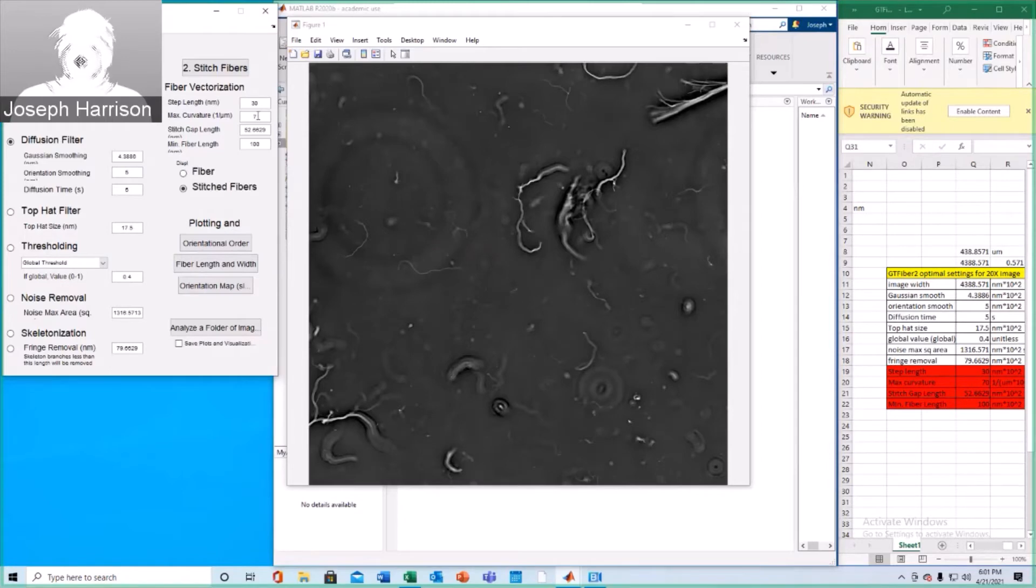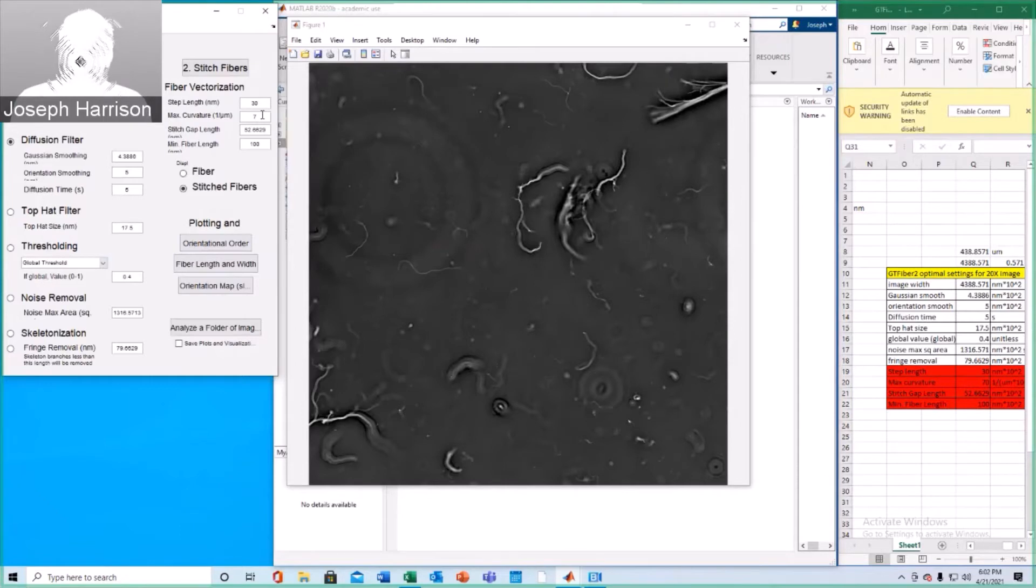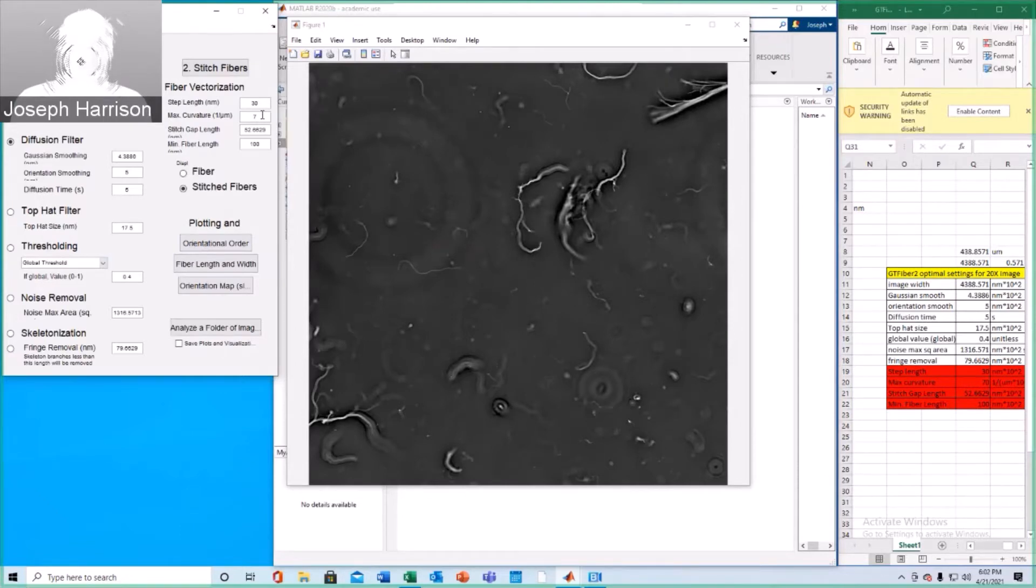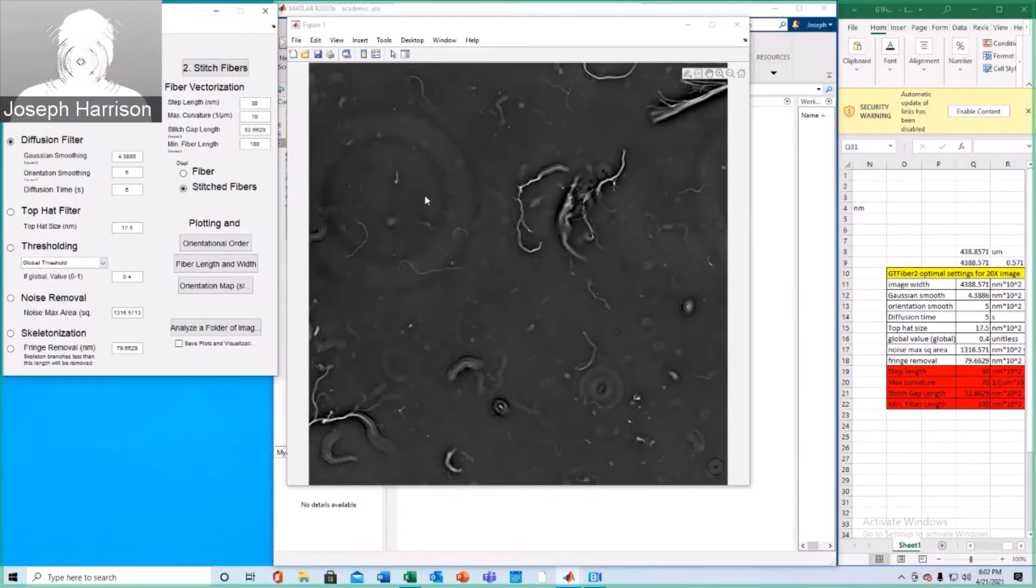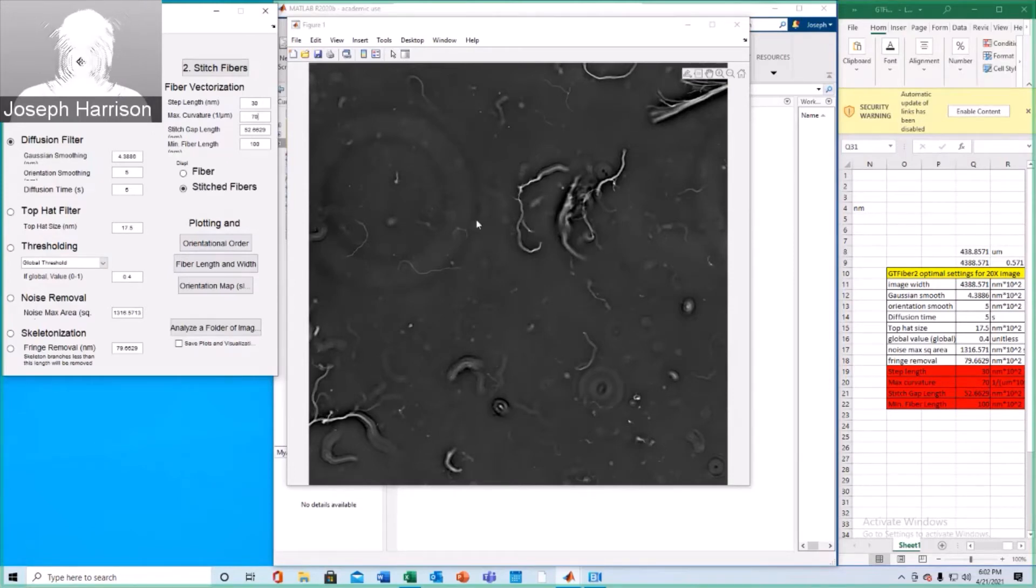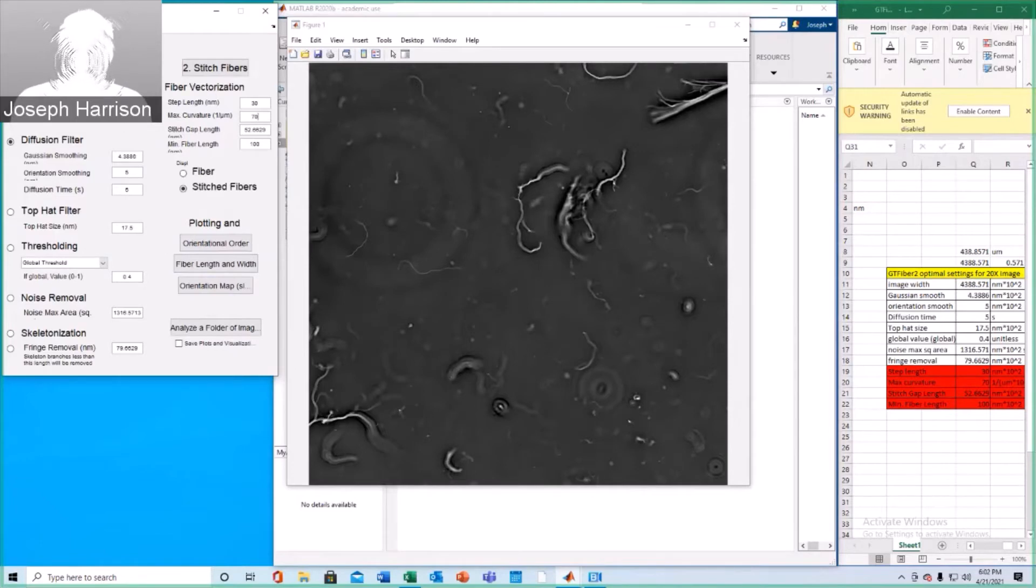And we'll go ahead and update these fiber vectorization parameters as well. You can leave most of these the same. The one thing I find very useful, however, is to update the max curvature to 70. Otherwise, whenever these fibers are vectorized, it's typically an overly linear approximation and you won't have as accurate of results. Okay, so let's go ahead and run this filter.